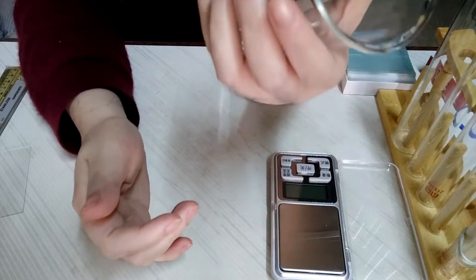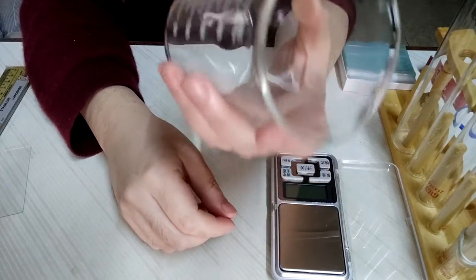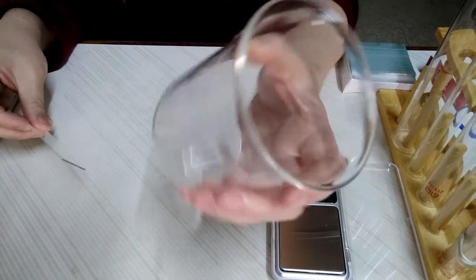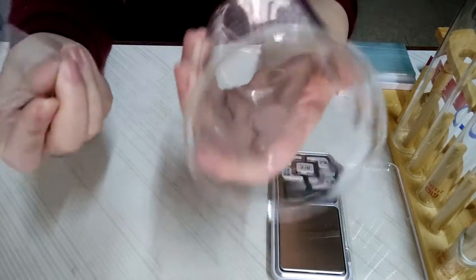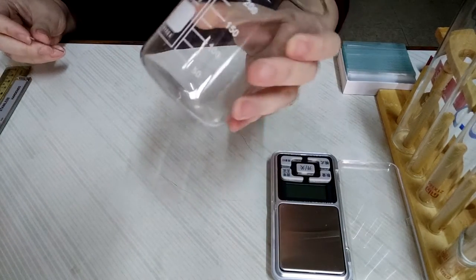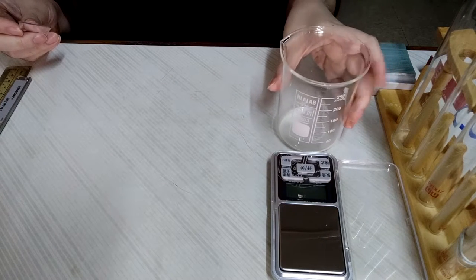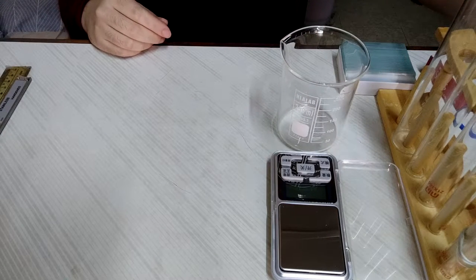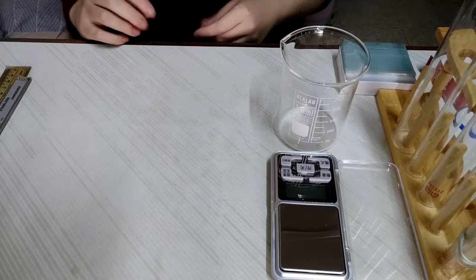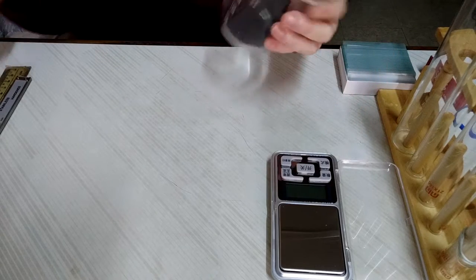So if your school or laboratory contains glassware that contains a mix of both kinds of glass, try to pick the transparent one, especially if you are heating or cooling something.